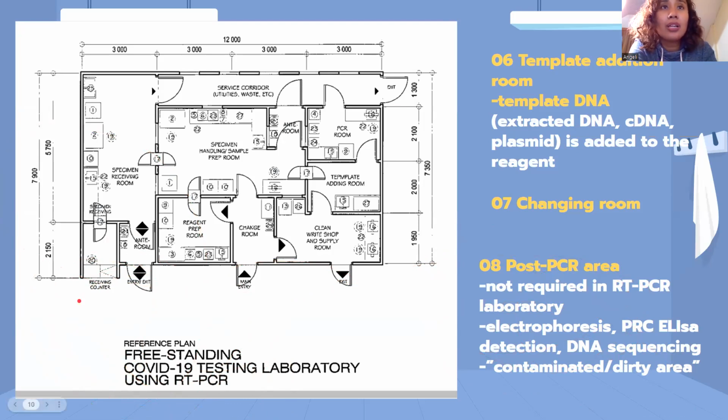Okay? However, may pagkalabo nga itong AO14, biglang sa floor plan nila, may template addition room or template adding room. So, when we say template DNA, the DNA extracted from the sample is called your template DNA already. So, ito na yung ifo-photocopy nung RT-PCR, okay? So, it could be from the extracted DNA.